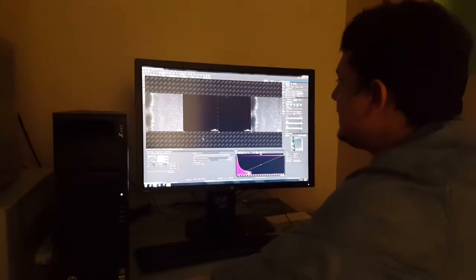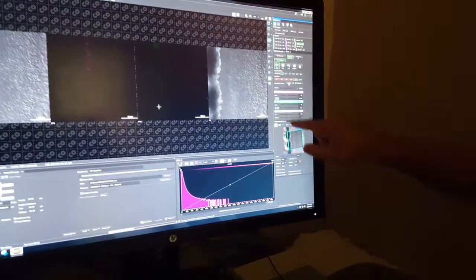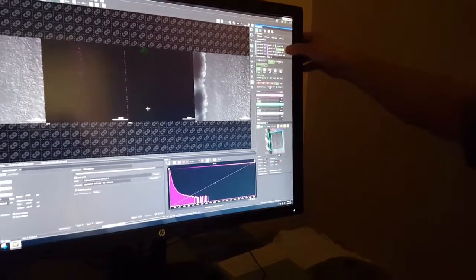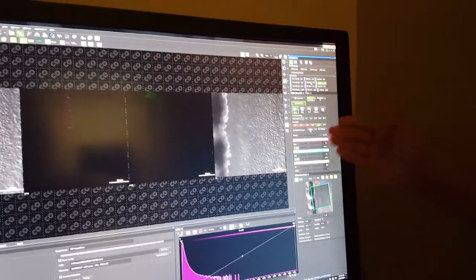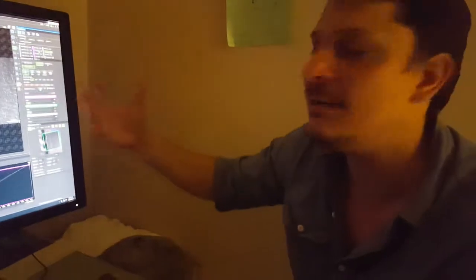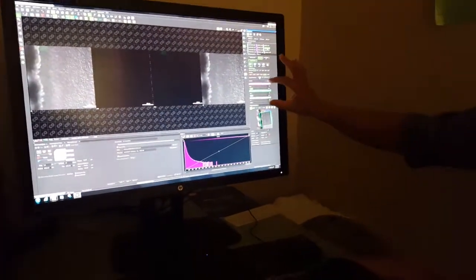Now that I have it, I want to scan the other ones. But if you change any setting here, you will have this exclamation mark in red here. That means that you changed something. If you change and click here, you're going to lose what you did here, and you have to recalibrate it again. So what you have to do to maintain this is to click the right button of the mouse, and assign current camera setting. You click there, it disappears, and this new set is saved.